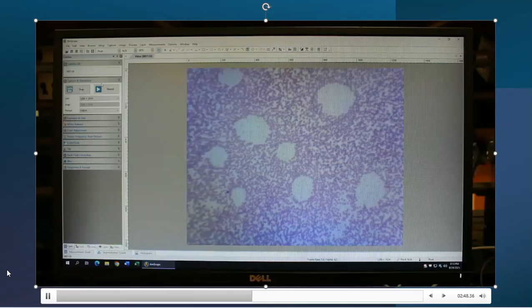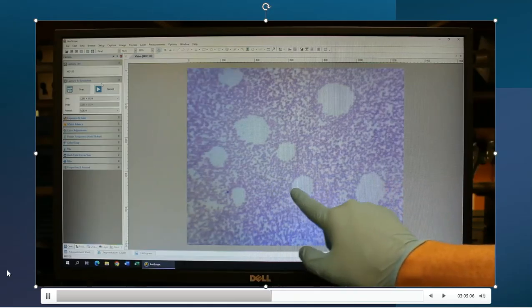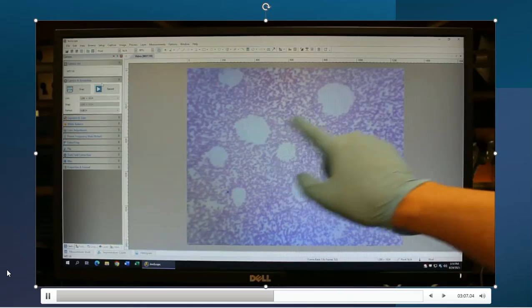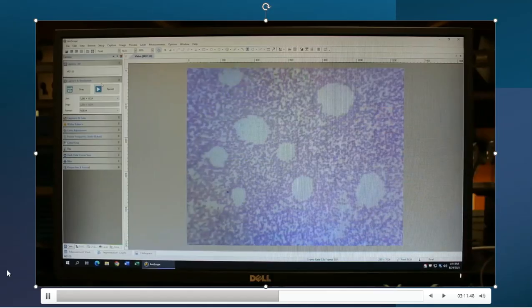And then I start with the lowest lens setting as possible. So as you can see, it just took me a few seconds to move back away from the lens, and I get something that looks like something now. All of these little red spots are probably blood samples. These spots here, there's nothing there. It's just kind of a void area. Don't really know what that is yet. Don't really care. My job is to get this maybe in focus as much as possible.